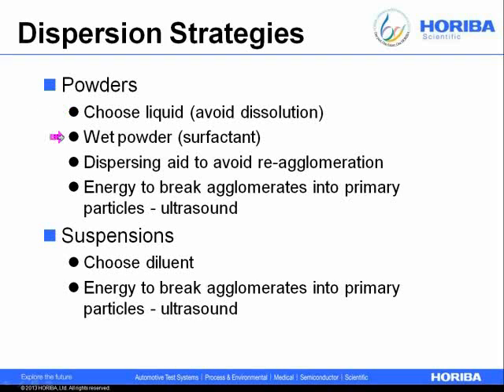You need to find a way to make the powder wet, and what I mean by that is that you need the liquid to be in intimate contact with the particle surface. You might need some dispersing aids to avoid reagglomeration. So if you have particles and they're wetted, you want to make sure they don't decide to stick together anyway, even though the liquid's trying to move them apart.